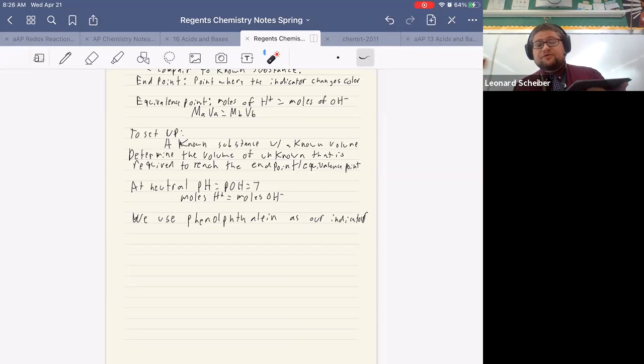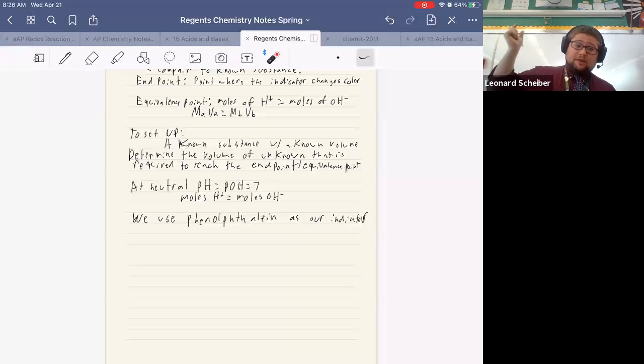Titrations are a super useful technique that are used throughout a lot of chemistry. And you can do more than just acids and bases. You can actually do this with figuring out how soluble a substance is. You can figure out the pH of specific types of acids. You can figure out the concentration of more than just acids and bases, of specific salt waters by looking at conductivity. And it's a really useful technique.